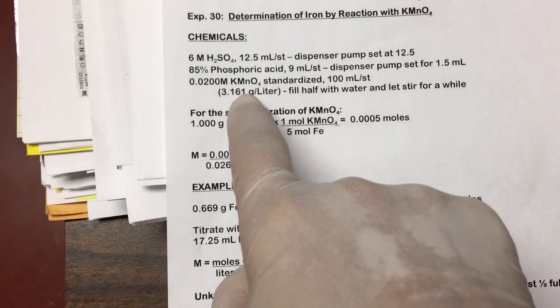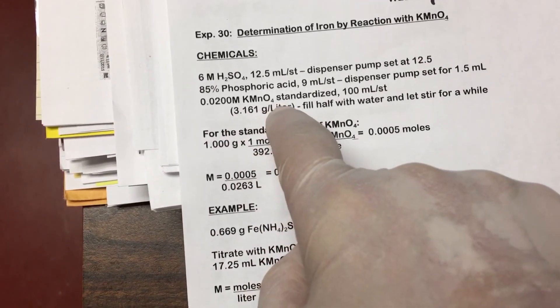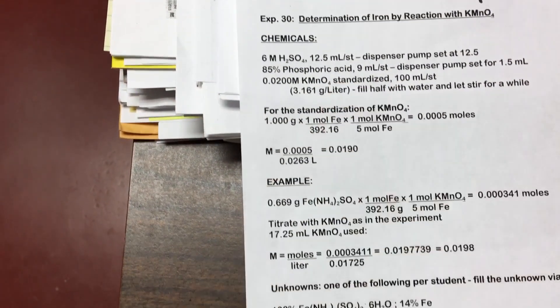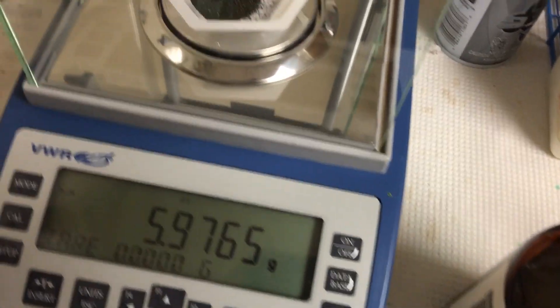Based upon that formula weight, you're going to add 3.161 grams per liter of DI water. But we're not going to make 1 liter, we're going to make 2 liters — so 3.161 times 2, which is going to be about 6.322 grams.